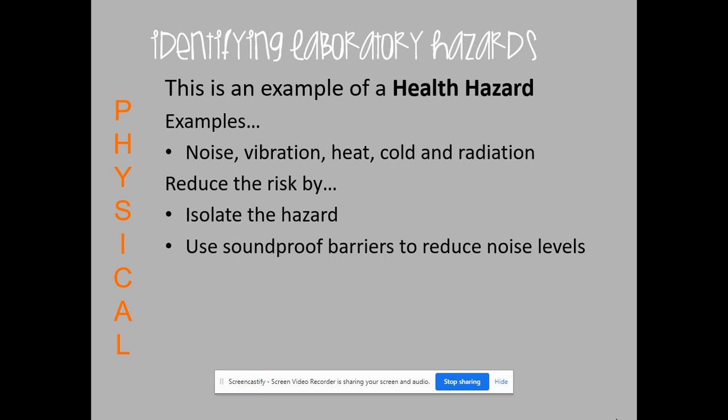Use soundproof barriers to reduce noise levels. And I guess maybe more realistically for us, that's using earplugs. Limit our exposure. That definitely makes a big deal.